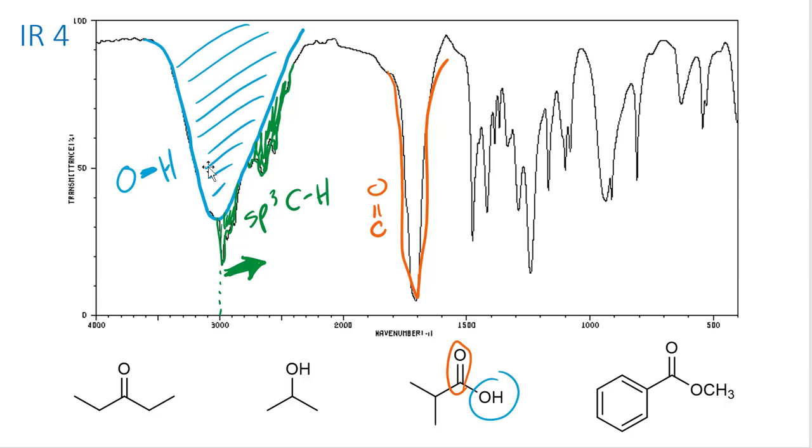So if you were to think of this thing as turning upside down, the green CH absorbances are like trees on a mountaintop. On a level field, we'd see the trees all the same height, but since we're on the side of a mountain, some of them at the peak, or in this case upside down in the valley, are taller than those that are further along the slope.